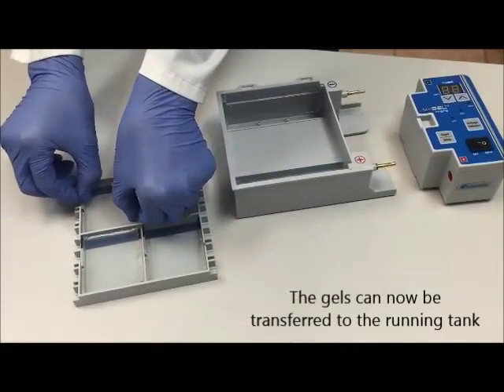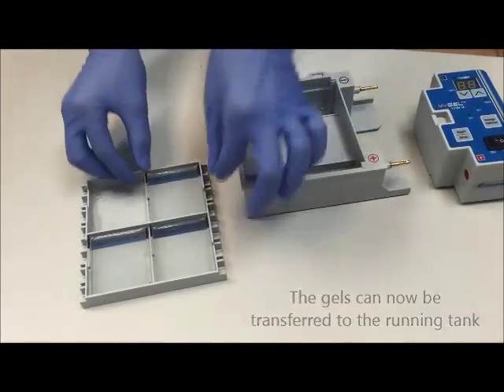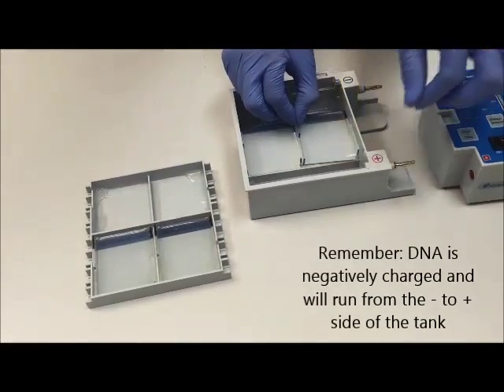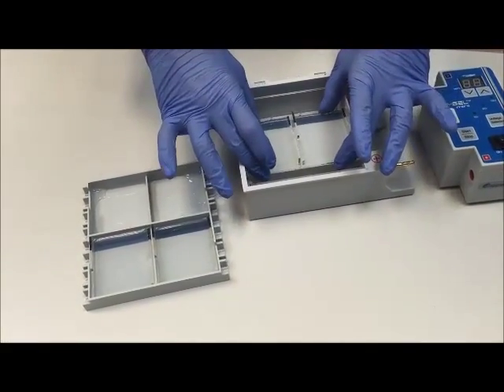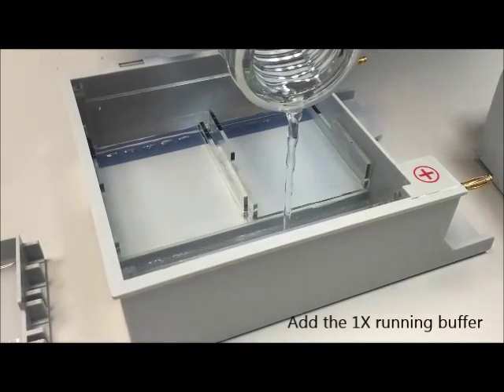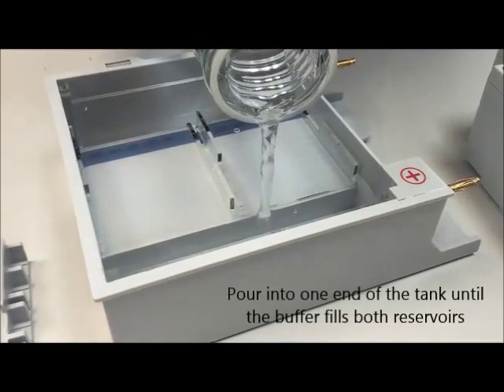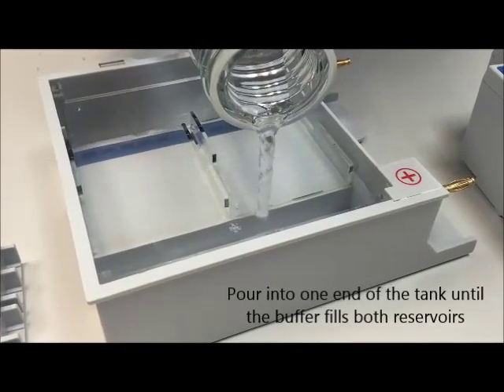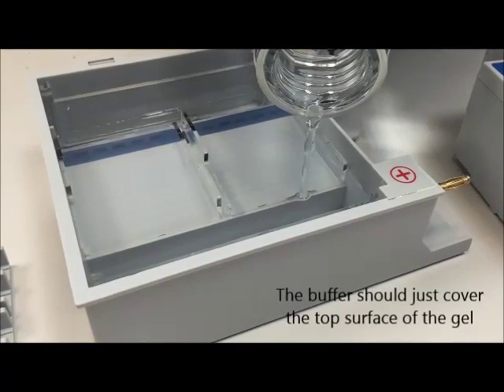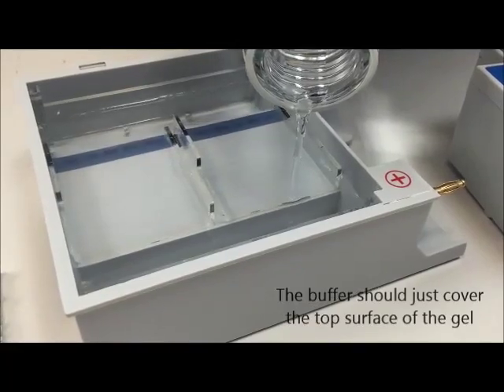The gels can now be transferred to the running tank. Remember to put the gels in the right orientation — the DNA will be running from the negative side to the positive side of the tank. Next, add the 1x buffer to the running tank. Slowly pour the buffer into one end of the tank until the buffer fills both reservoirs. There is enough buffer in the tank when both reservoirs are filled and there is a small amount of buffer covering the gel.